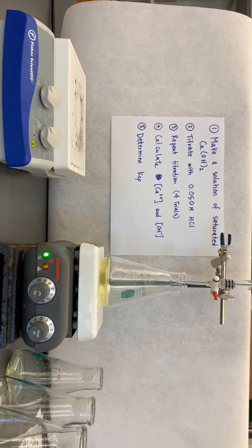Okay, it looks fairly yellow to me. Okay. So I got here 4 mils exactly, 4.0 mils. Okay.